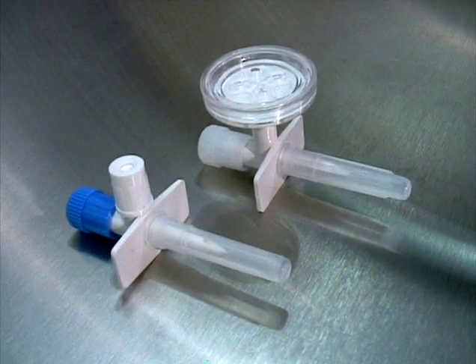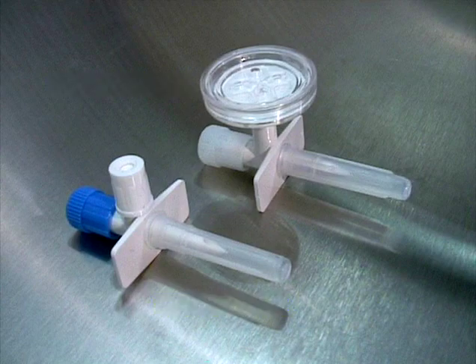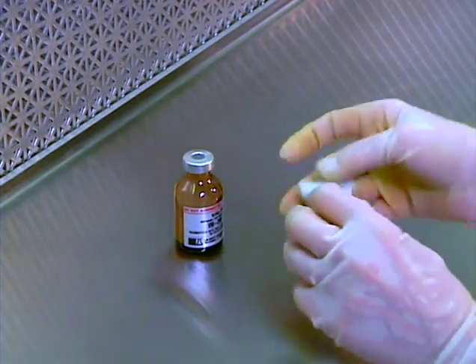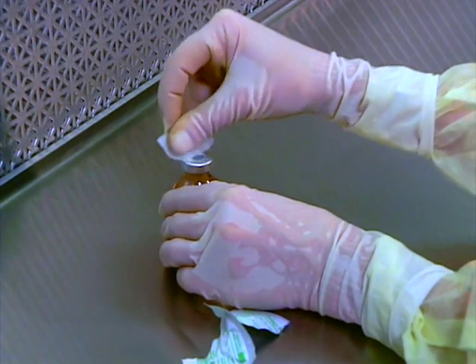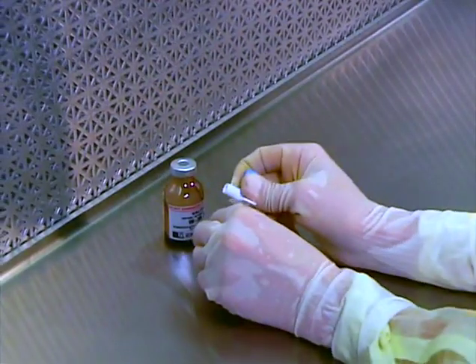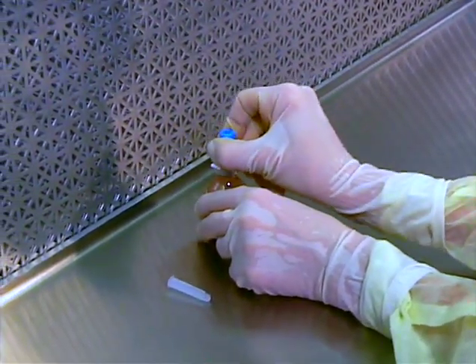While dispensing pins do reduce the risk of coring, and use of a pin with a hydrophobic filter can reduce the risk of drug release into the environment, improper technique or use of a hydrophilic pin can increase the risk of drug release. Be certain the vial septum is disinfected and has dried completely. Locate the vial so that the flow of first air over the septum will not be interrupted. Remove the spike cover by pulling straight out and insert the pin into the middle of the septum.